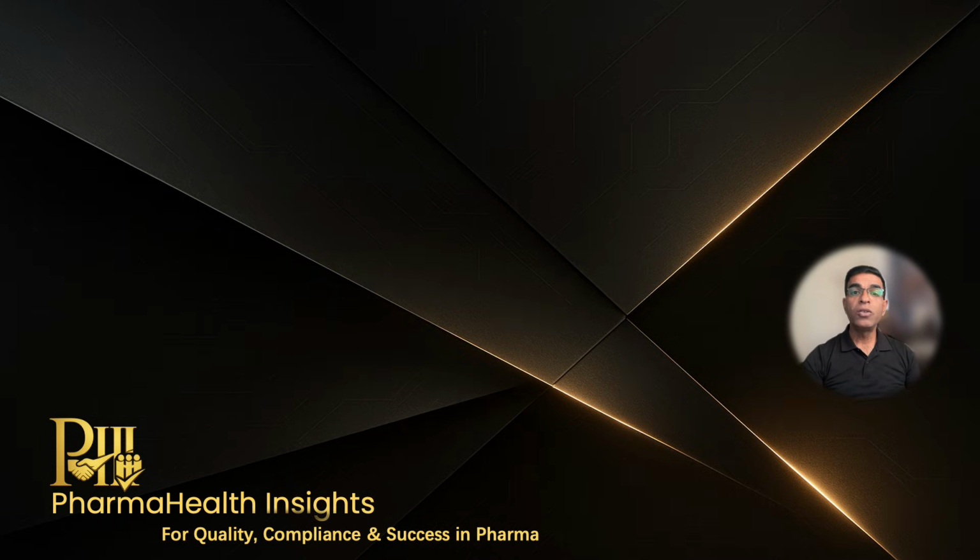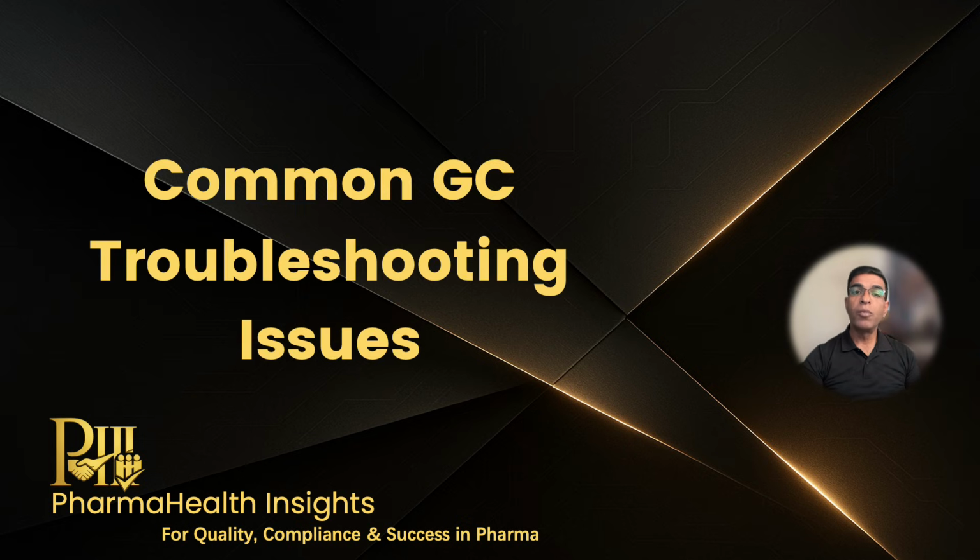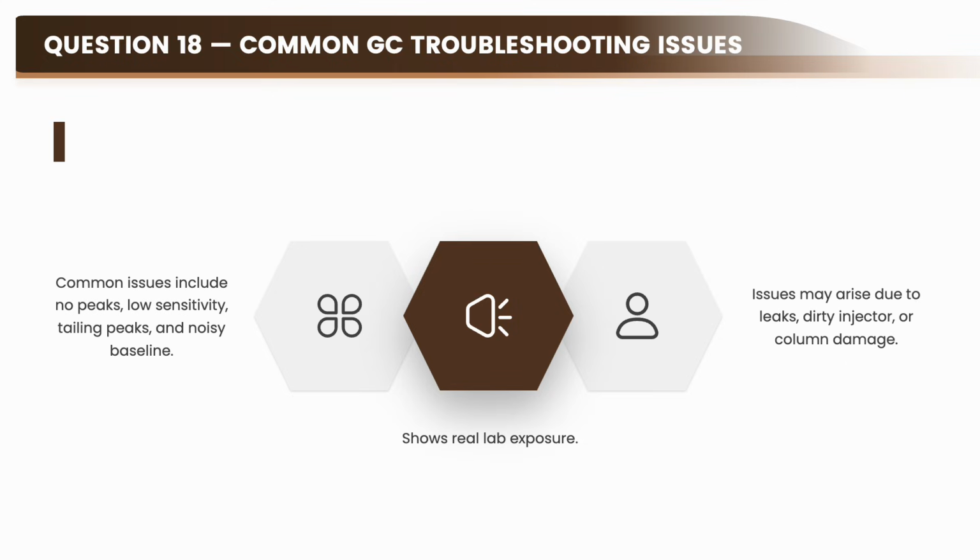So friends, once you have answered all above questions confidently, the interviewer will become more practical and ask about problems. You can expect the next question to be, what are the common problems observed in GC analysis? You should answer like this.